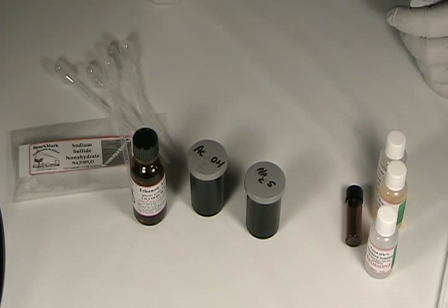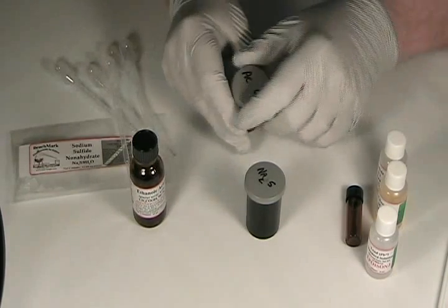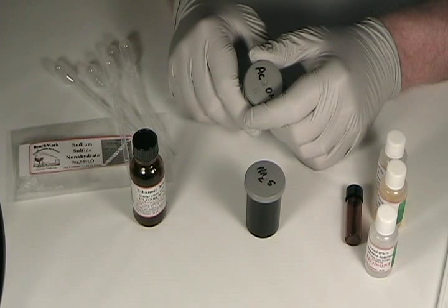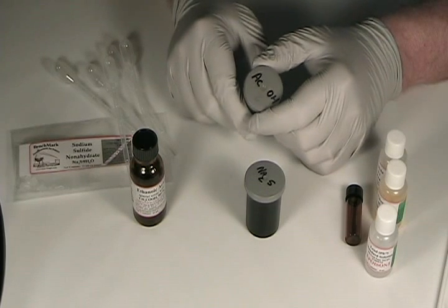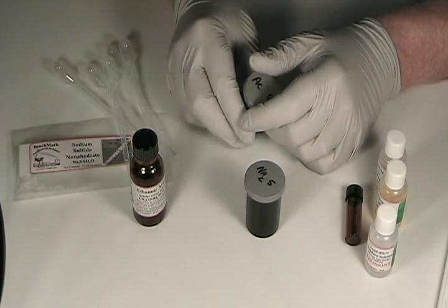Before we can do any tests, we need to make up two solutions: the sodium sulfide reagent and the acetic acid reagent. I've already made up the sodium sulfide reagent. All you need to do is open one of the small packets of sodium sulfide, put five milliliters — which is one teaspoon — of water in a small container. I'm using 35mm film cans. Add the contents of one packet, swirl, and cap it.